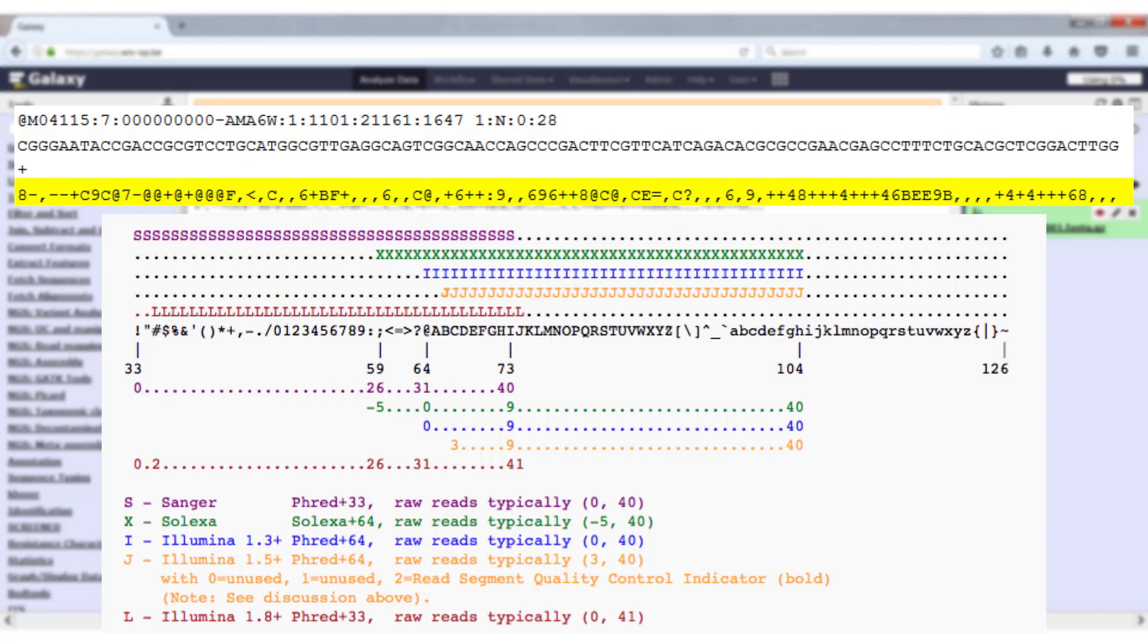It is also this way that several software packages try to detect which encoding is used for the quality scores. So a file with a capital S in the quality score can for instance never be a Sanger encoding or an Illumina 1.8 plus encoding.